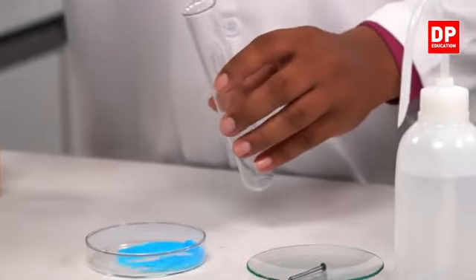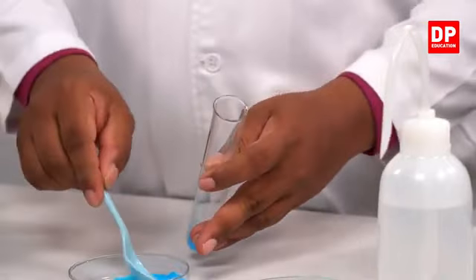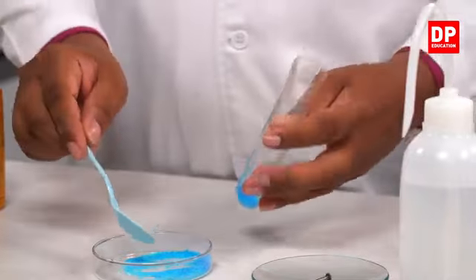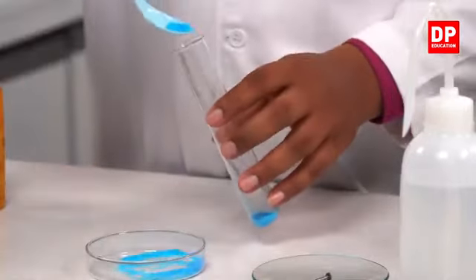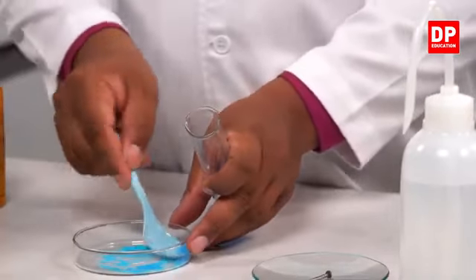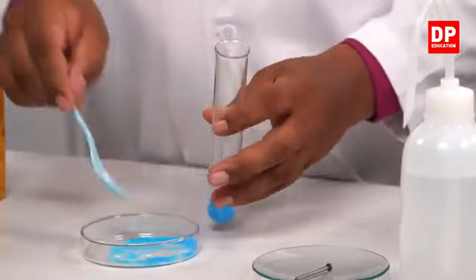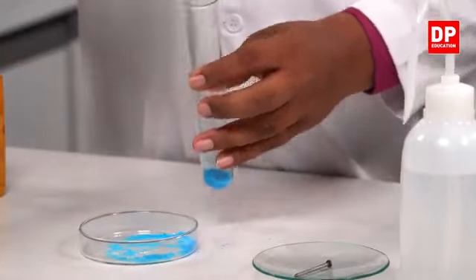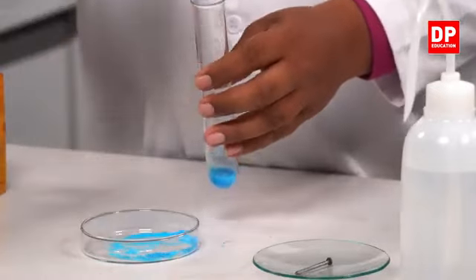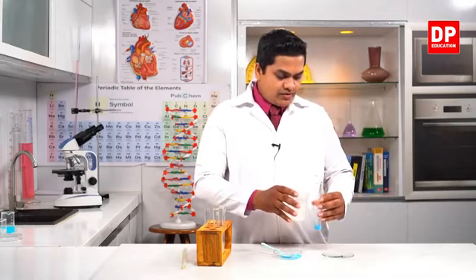So now I'm going to add this copper sulfate into the boiling tube. Then using a wash bottle, let's add some water.